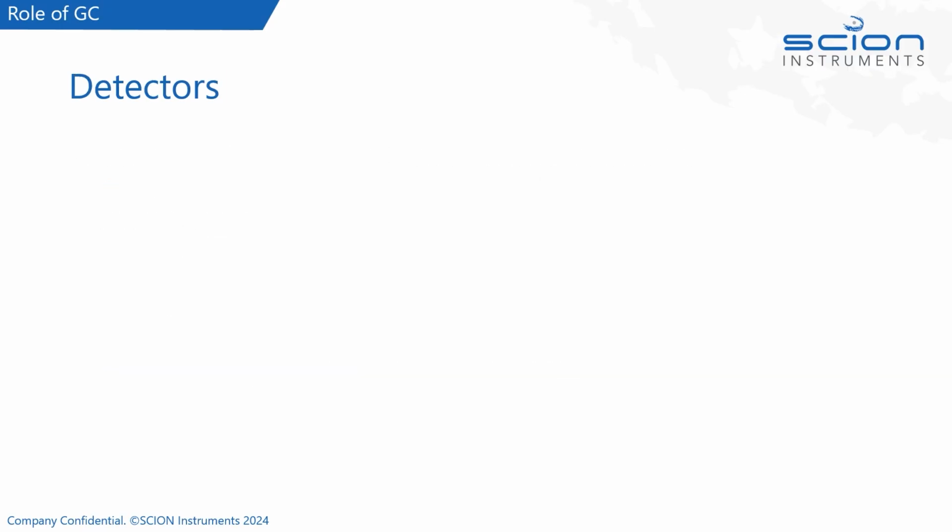I just want to quickly focus on one of the reasons why gas chromatography is such an effective technique, and that is the range of detectors that we have available to us. I'm just going to quickly run through some of the detectors we have at SCION Instruments and that are commonly used in the world of gas chromatography. We have the flame ionization detector, or FID. This is useful for the analysis of organic compounds.